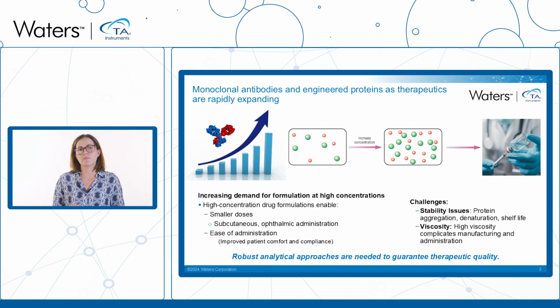Because of this, it is important to have the right analytical tools that allow testing and characterizing this type of protein formulations at high concentrations. In today's webinar, our main focus is going to be on how we can measure thermal stability and why testing at high concentrations is important.